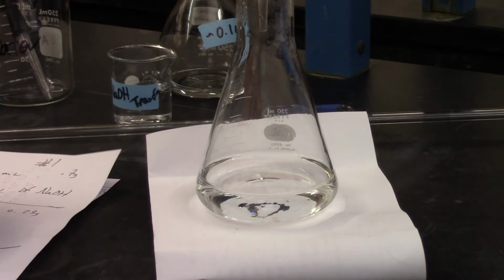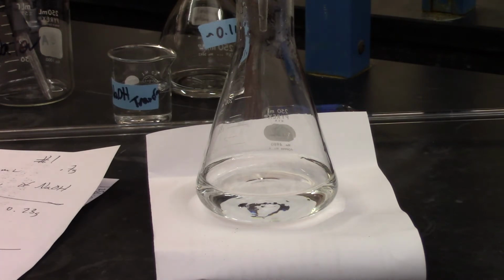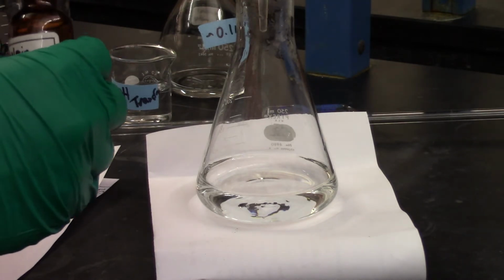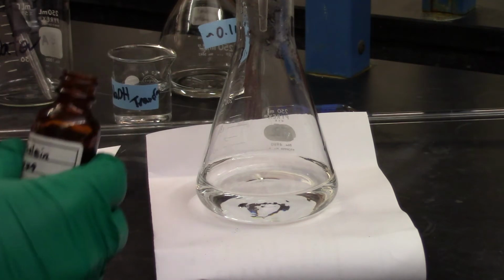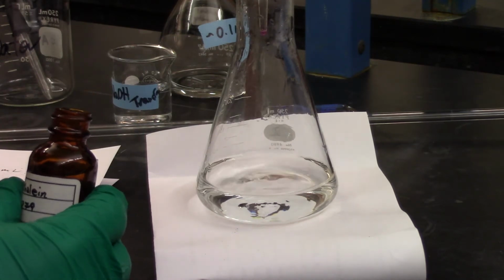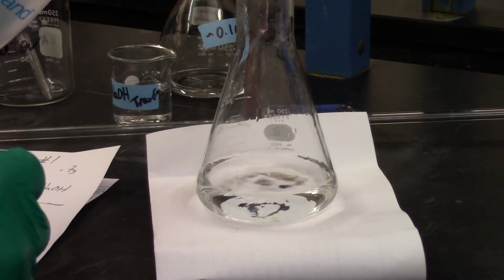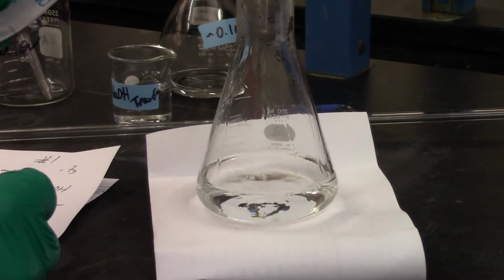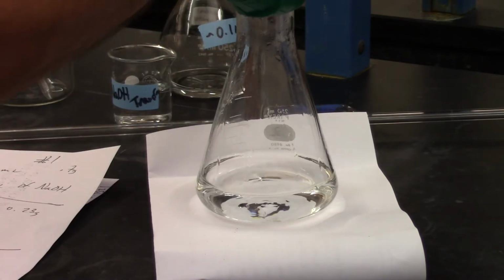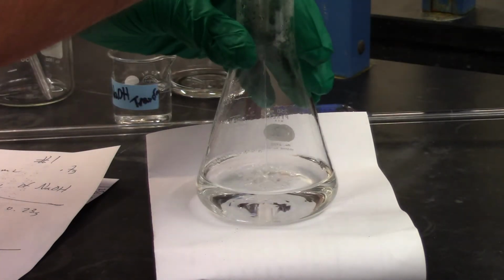If this one is about 0.43, I would say it would take about 24 mils. So 12 plus 24, I'd say I'm going to go down to around 36. So again, phenolphthalein, can never forget that. Always have to put that in. Go. And rinse. So I'm going to guess around 36-ish. Let's let her go.